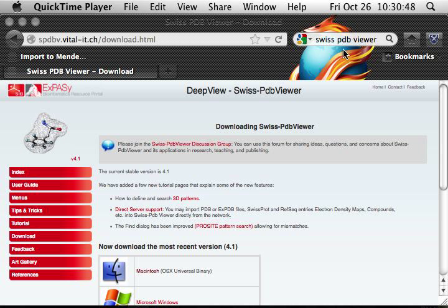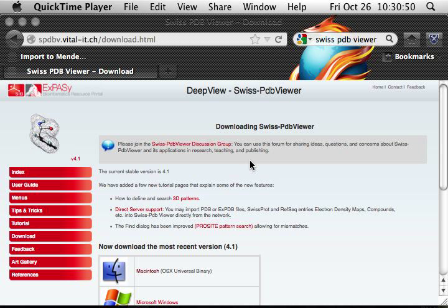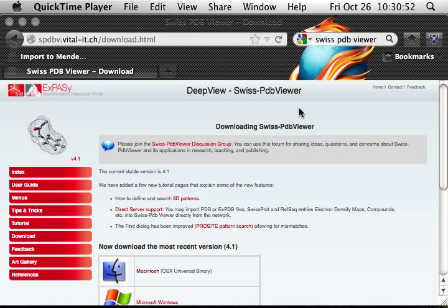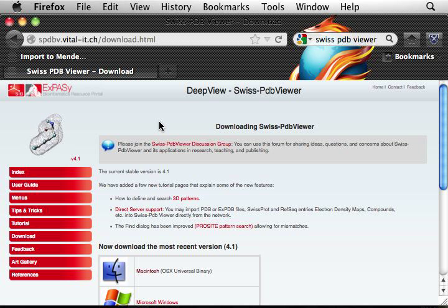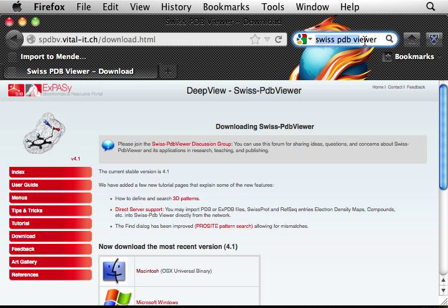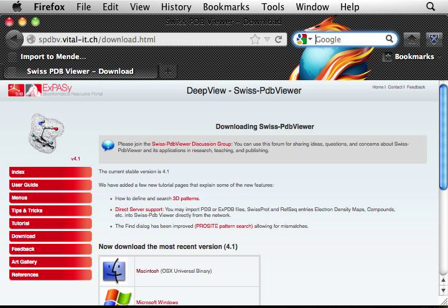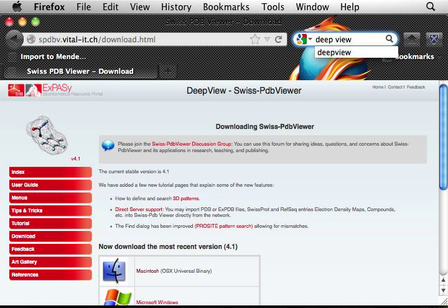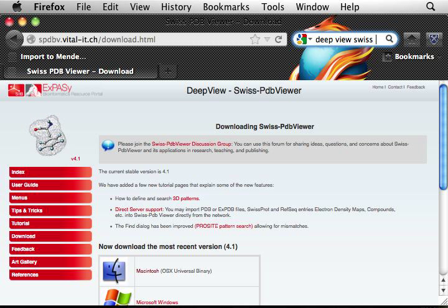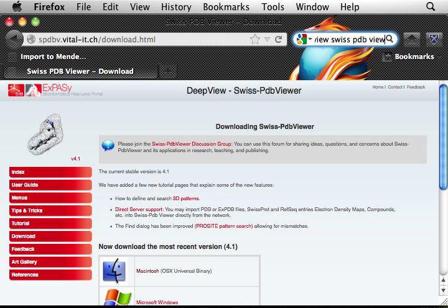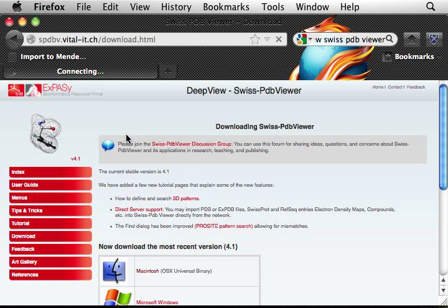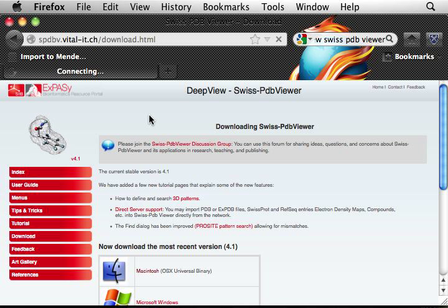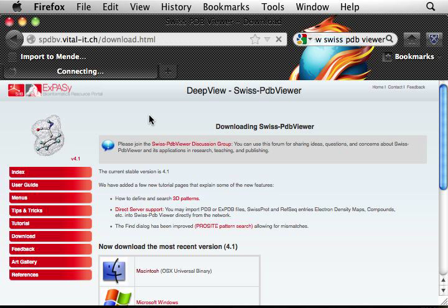So you can go to your favorite web browser. Here I use Firefox. So I can search either DeepView or Swiss PDB Viewer. And usually that should be the top hit if you Google it. And let's see whether that's the case.